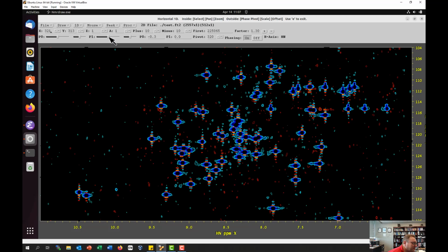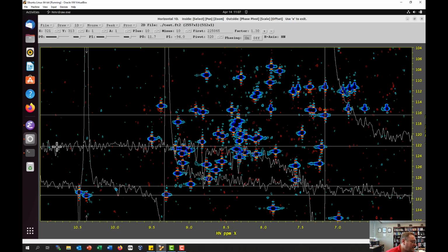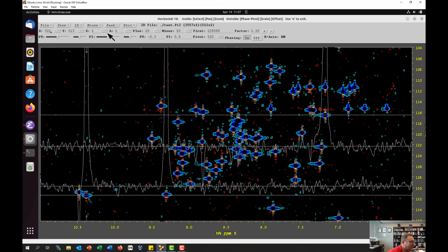But the peak that's a little bit farther away, this peak is now becoming more dispersive, and this peak has become really dispersive. And so you can think, again, the phase correction is increasing as you go from the left to the right. But again, we don't need to do that here, because all of the peaks are pretty much the same, and that's really what you're aiming for.